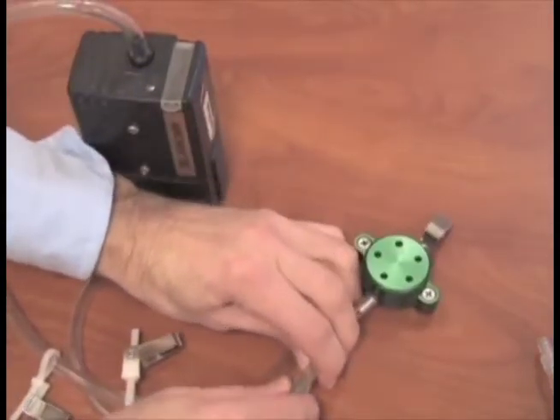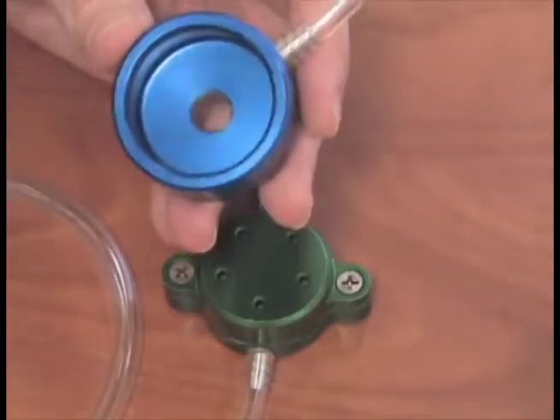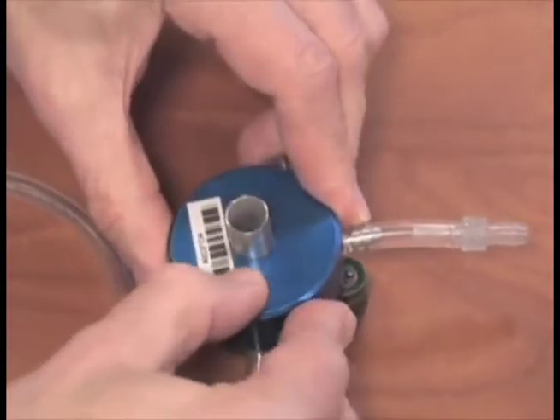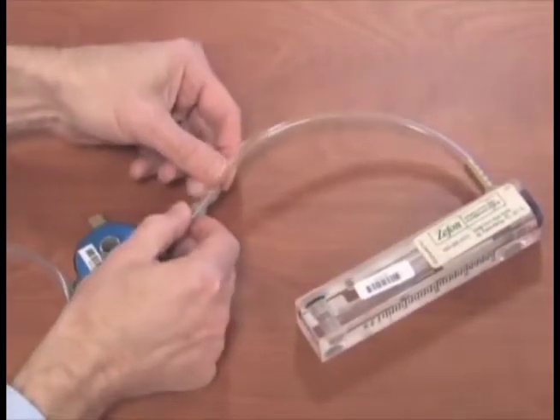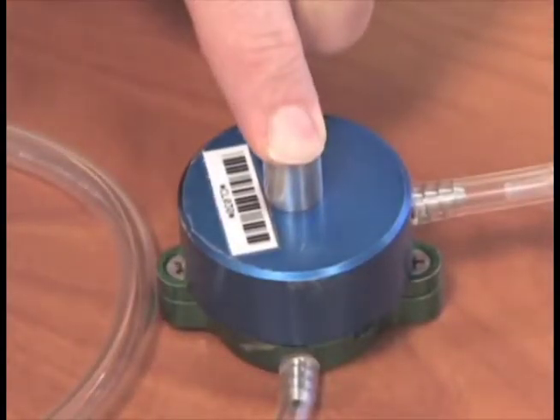To set up calibration, install the tubing to the pump and then to the PEM. Check to be sure the O-ring is properly seated in the O-ring groove inside the calibration cap. Push the calibration cap onto the PEM. Connect the rotometer to the calibration cap. Cover the top larger opening of the calibration cap with your finger while calibrating to create a tight seal.